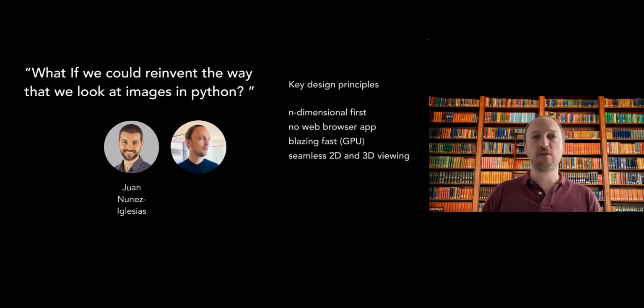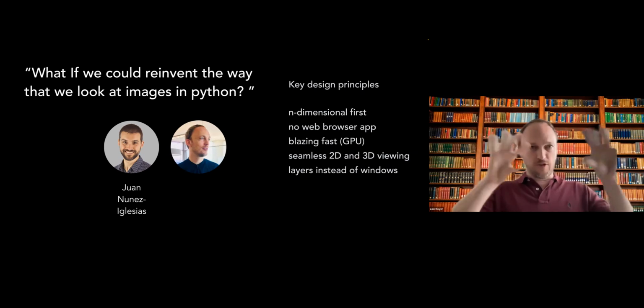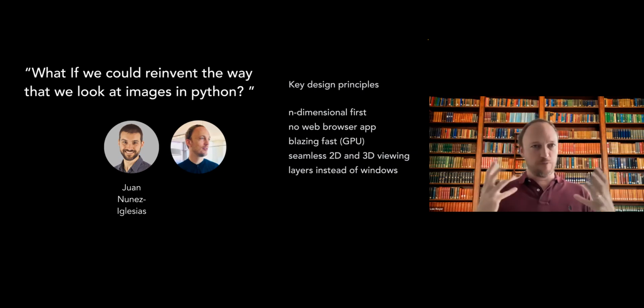And we had some ideas along seamless integration of 2D and 3D viewing, and we also wanted to go away from this notion of having lots of windows popping up on your screen with lots of images. We wanted something a little bit more integrated. So we took inspiration from other tools that had been developed for almost decades, such as Photoshop and Illustrator, and we were thinking along these lines. And this was really a dream at that point, right?